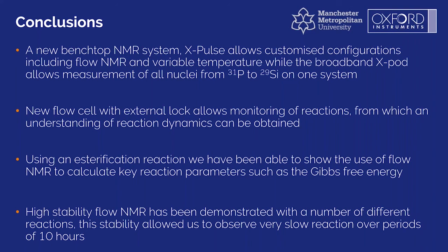I've also shown you how we can calculate some key reaction parameters, such as Gibbs free energy, enthalpy, and entropy. And I've also explored the stability in terms of collecting data over a long period of time, which may be required if you're looking at a particularly slow-moving reaction in terms of completion.